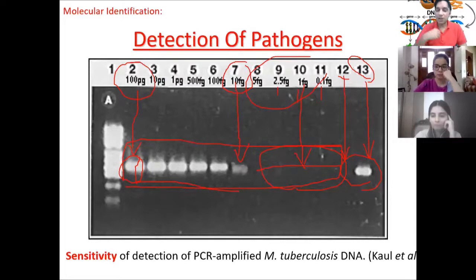That will help us to confirm that whatever we were doing in the other experiment was correct, because the positive control should give you the result. And in the negative control, we do not add any template. We add everything else, but not the template. So if the template is not there, you should not get the product. In a positive control, we put the template. Manually means we put it in ourselves.